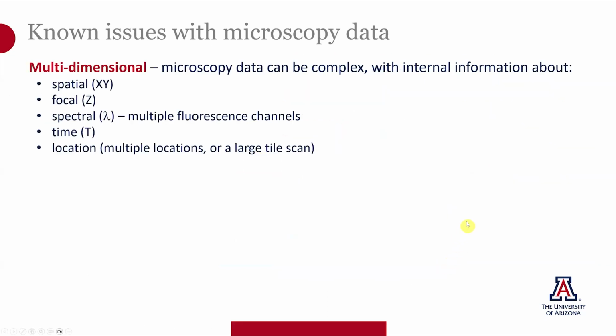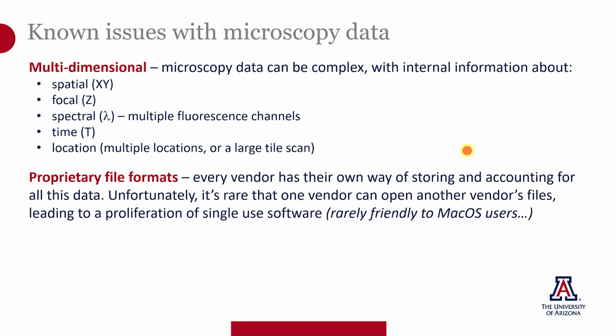There's a number of problems with microscopy data. Microscopy data can be very complex. We have XY information, we may have Z-stacks or focal information, multiple fluorescence channels, or even spectral information, time information. And if we're doing a very large tile scan, we may have locational information. And all of that comes in a proprietary format because the vendors have different ways of storing and taking into account what data is important to know about for these different multiple dimensions.